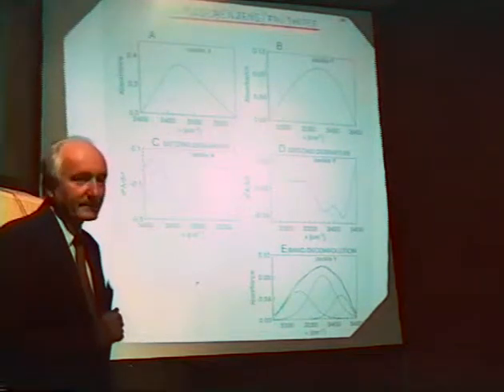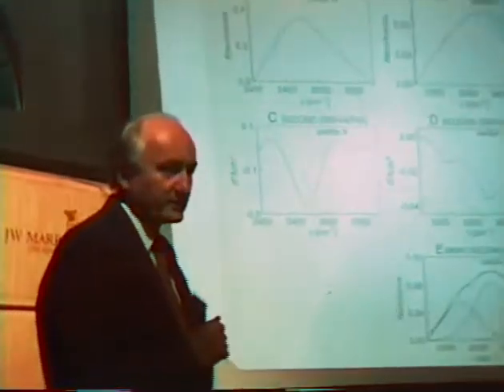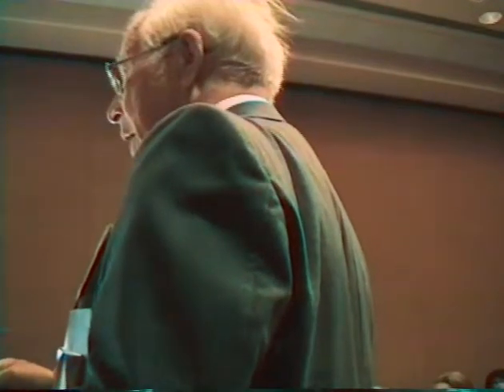This is the right answer, when forming the hydrogen bonding with certain molecules. Yeah, as deduced by the second derivative of those curves, which are rather broad. The thing is, in a faujasite, you've got 4 different kinds of oxygens. Yes, this is what I want. And the OH frequencies, there are 2: those vibrating inside the cuboctahedron and those vibrating in the big cavity. It's not clear to me how you can separate those.